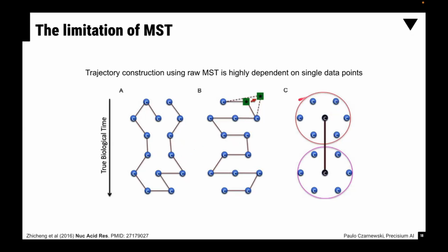So what they do instead, they cluster the groups of cells. So they are not based on the individual cells, but they will be based on the clustering that you set. And that's why when you do Slingshot or PAGA, you do clustering, let's say using your Leiden clusters. And instead of using all the single cells, you use now the cluster centroids or some sort of metric that represents your cell clusters.